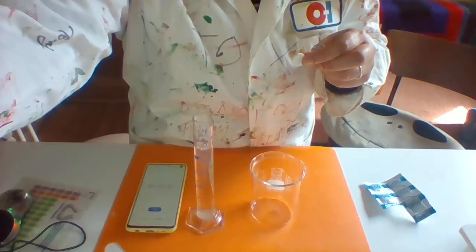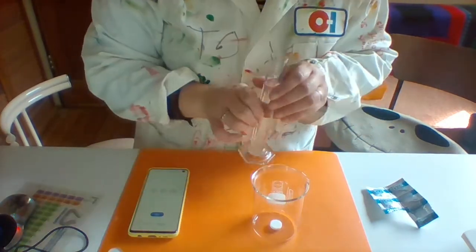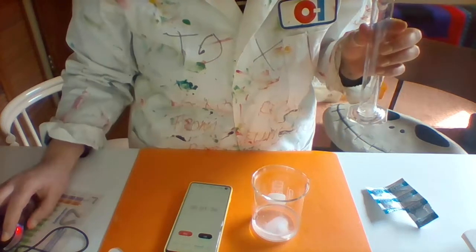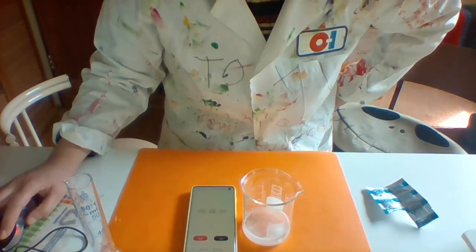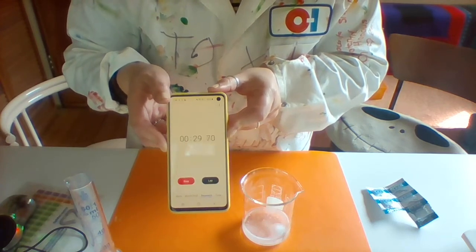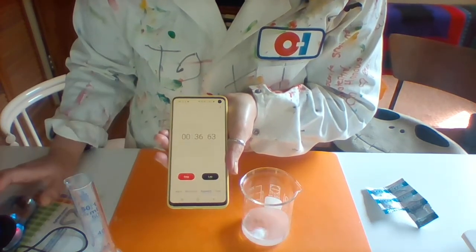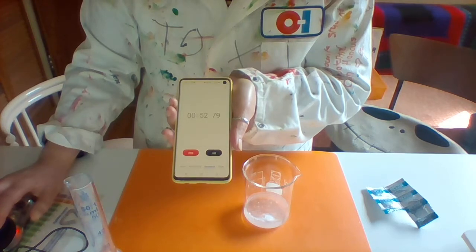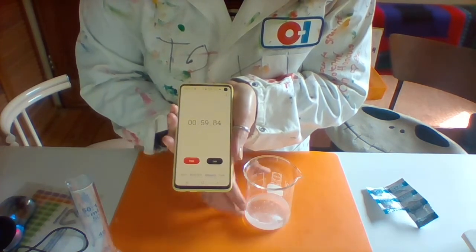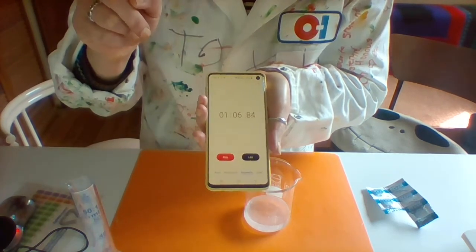So I'm going to put it in there — whole tablet, 50ml of water. Pour it in and start the timer. Still dissolving. Nearly done. And it's done — check the time.